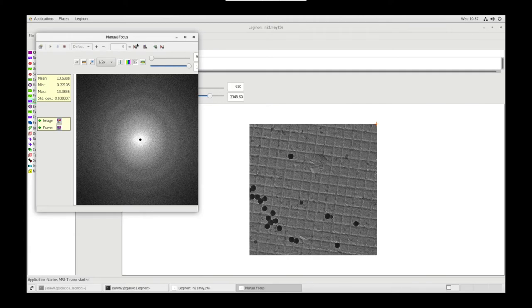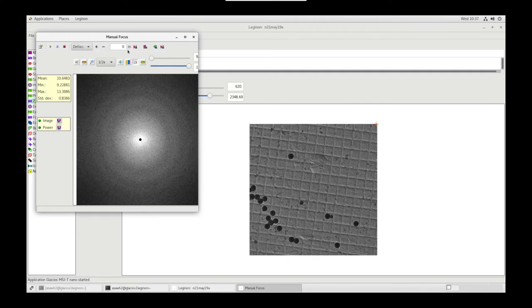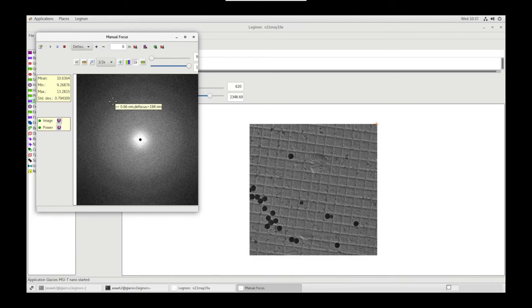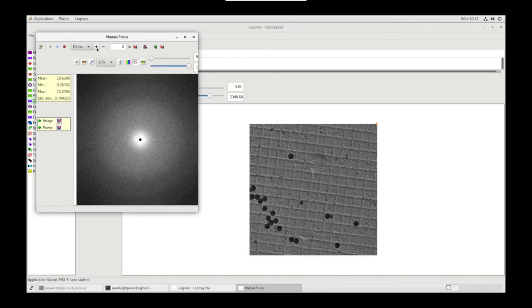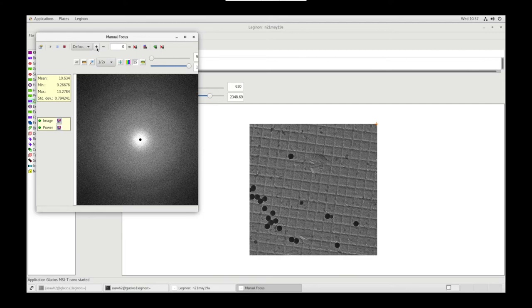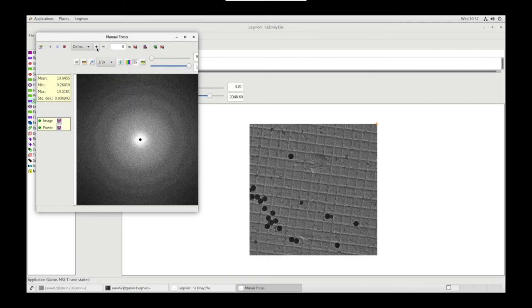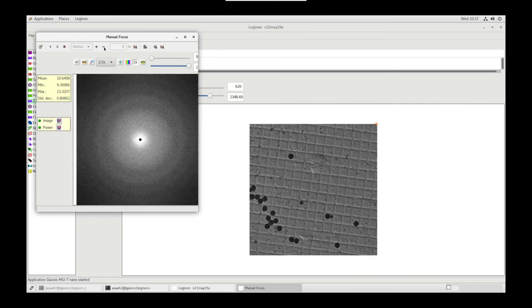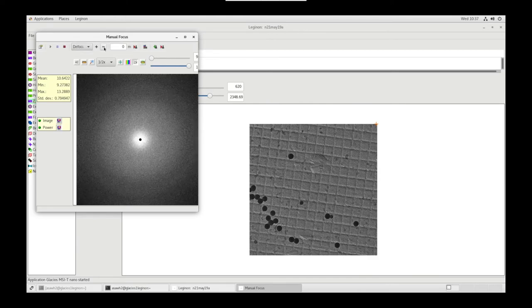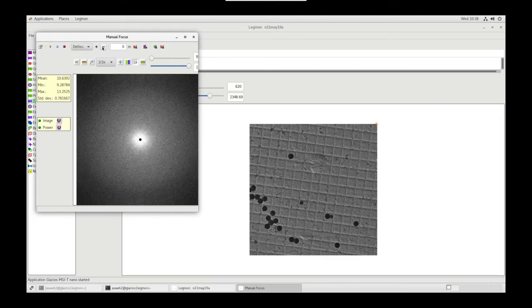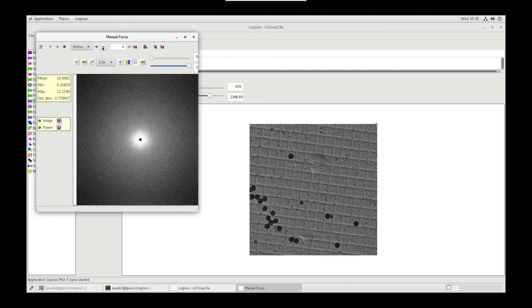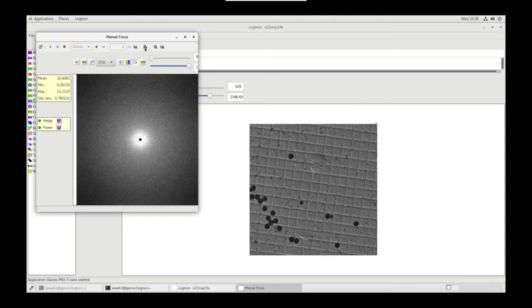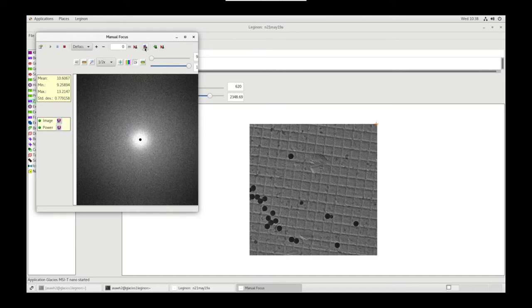Now let's click Manual Focus. Let's send Zero to Scope and toggle Show Resolution Defocus. Click on the first zero, or the first darkish ring that we see, and let's go up in increment. If the rings contract, then let's go down in increment until we can see that the first ring blends out to the edge. And that will be our true zero. Alright, let's reset this defocus. Click Stop. And we're done.